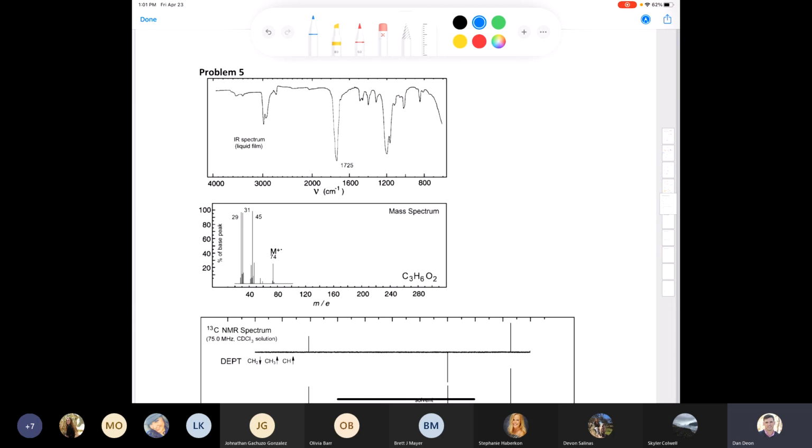Well, I'm just going to throw this out there to my students. If I kind of help you out here, and of course, when you're doing your assignment, you're going to have your IR and NMR tables to aid you. There's nothing wrong with that. I call those training wheels. Everybody looks at those tables once in a while. But the more signals that you have committed to memory, the more rewarding solving spectroscopy problems gets, the quicker it goes.